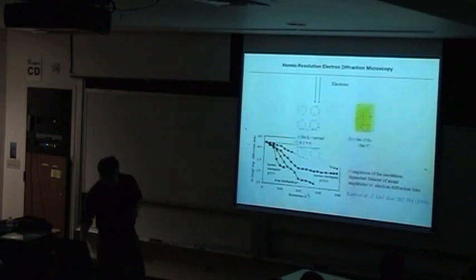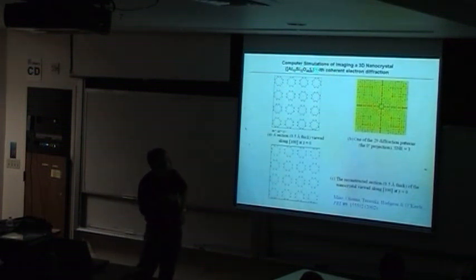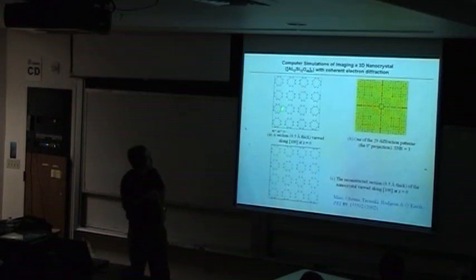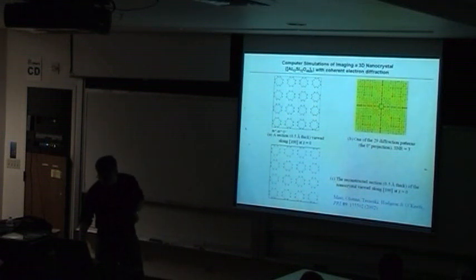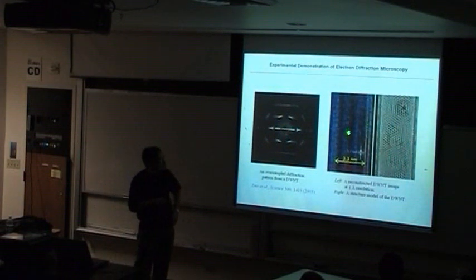And in 2002, we did some numerical simulation of a nanocrystal, and with a signal-to-noise ratio equal to 3, we can still reconstruct a single slice. We can still get the reconstruction, and then we tried to do some experiments, but one group at Illinois did the first experiment, on a carbon nanotube.